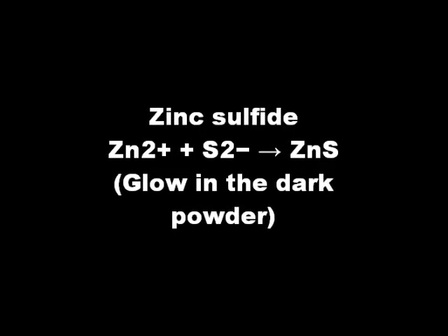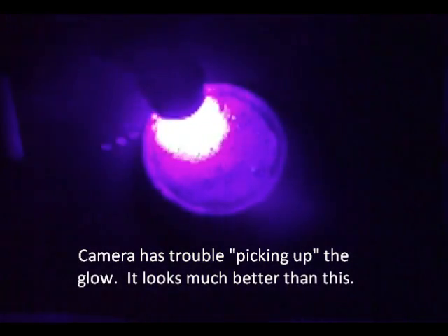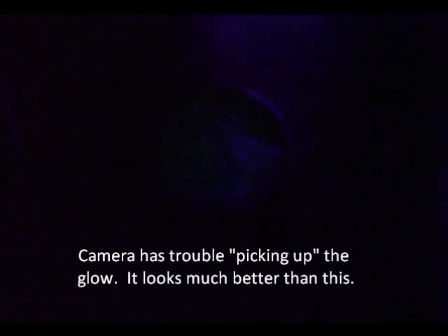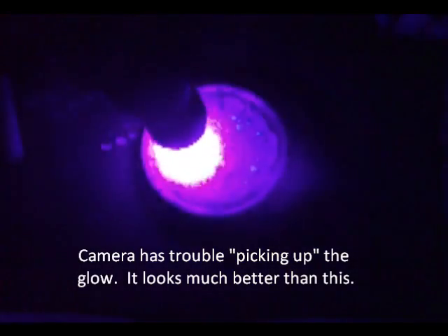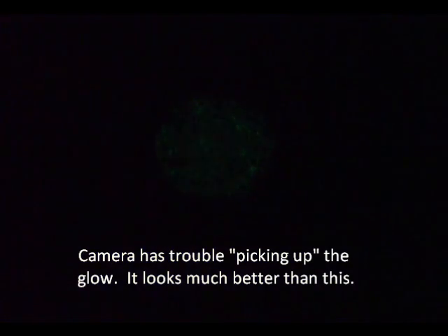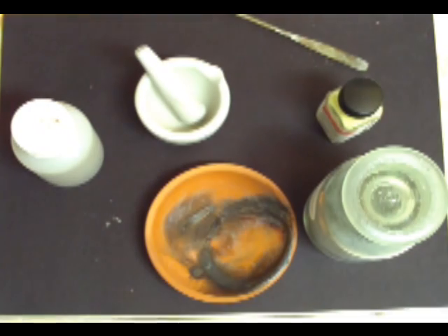Hey YouTube. Today we're going to make zinc sulfide, aka glow-in-the-dark powder. We'll be doing the quick and dirty method. I want to be honest and upfront — this is not commercial glow-in-the-dark powder, the kind that you can charge and it will last a couple hours. This is at best just so you can say to your friends, 'I've made some glow-in-the-dark powder.' Also, this reaction is great to show kids as it has a pyrotechnic aspect in the making. So let's get started.